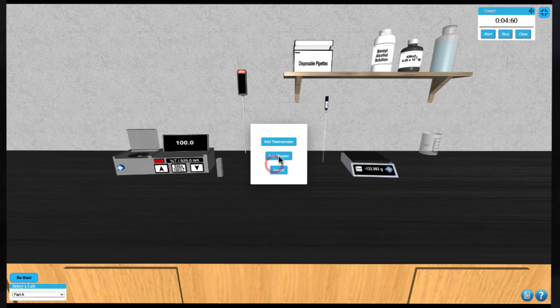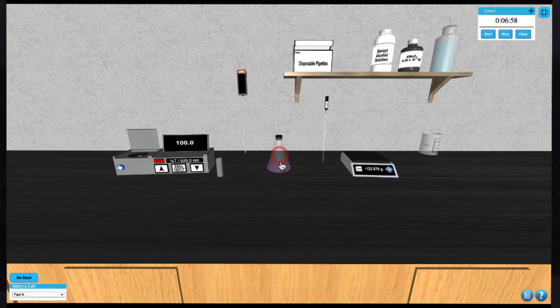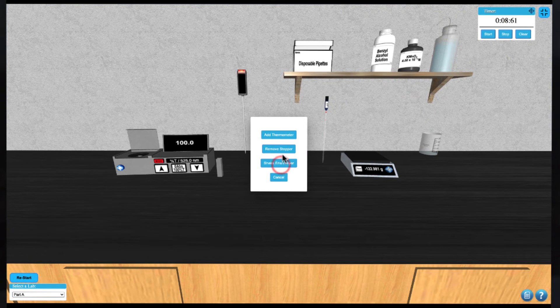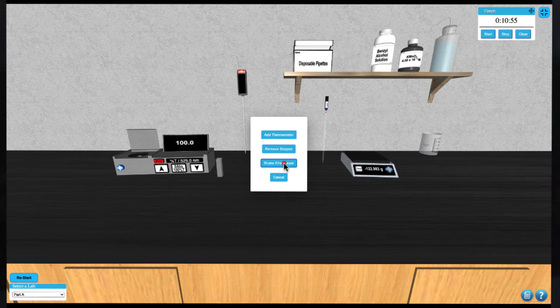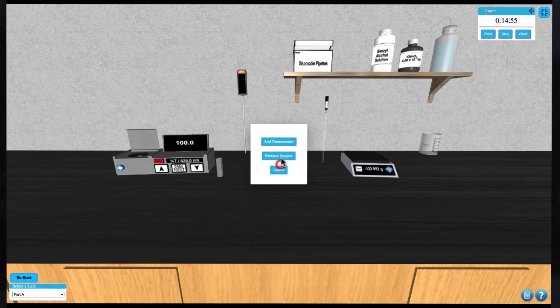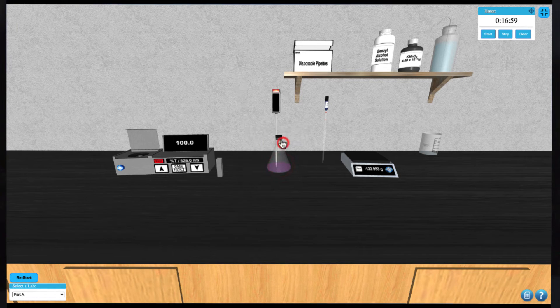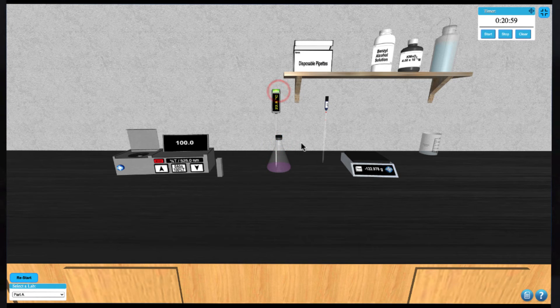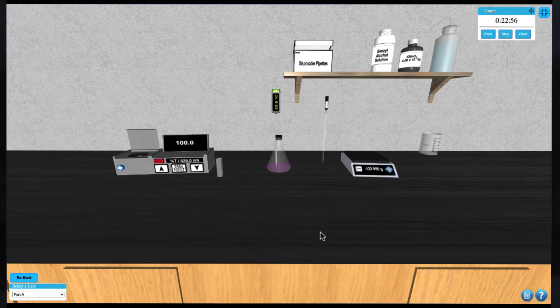You can now click on the Erlenmeyer and add a stopper and click it again to shake it. Click on the Erlenmeyer to add the thermometer at any point to get a temperature reading.